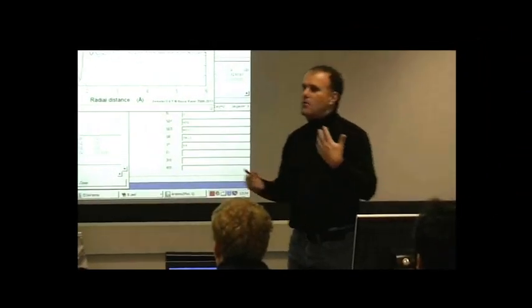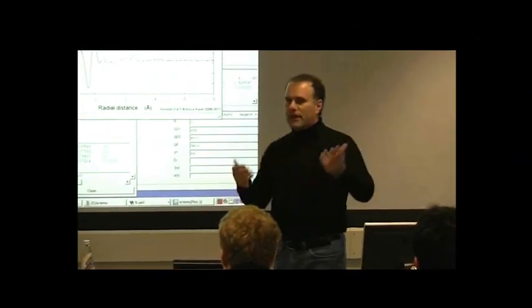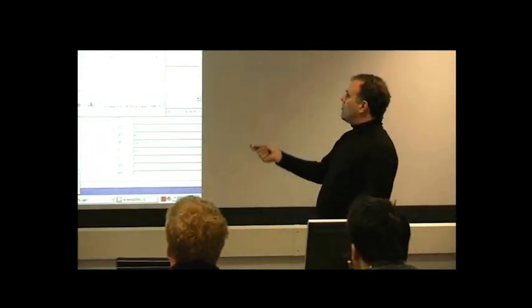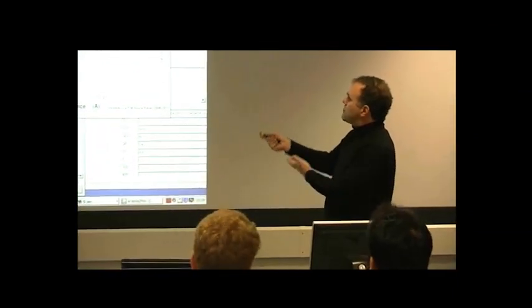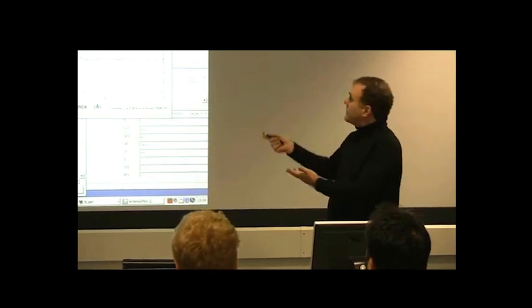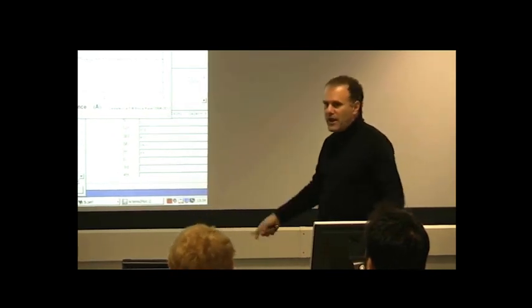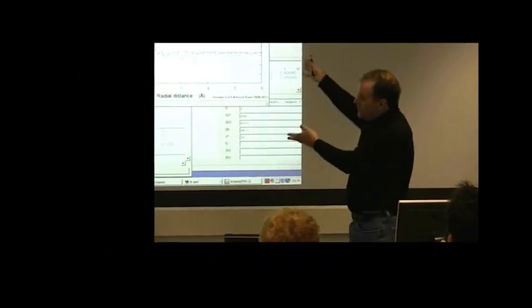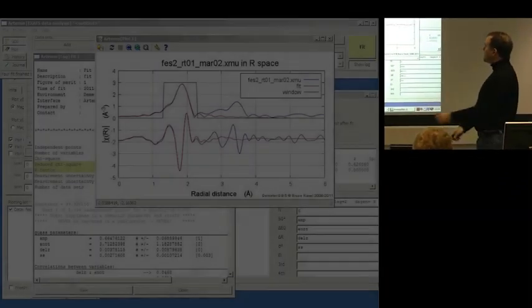So if this were a real research problem, then we would be compelled or interested in worrying about more of the data, because we have perfectly beautiful data with really big signal all the way out here. So if our interest is learning something about this material, we should make use of the data that's in front of us.